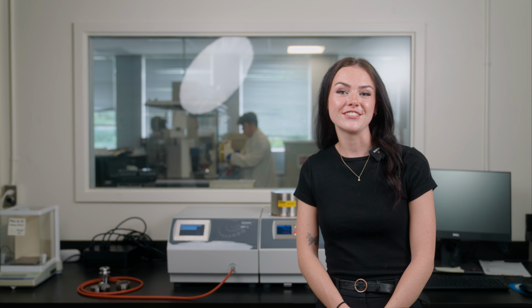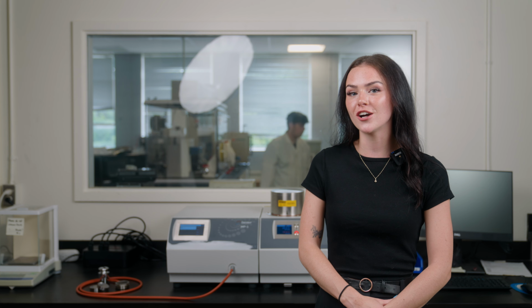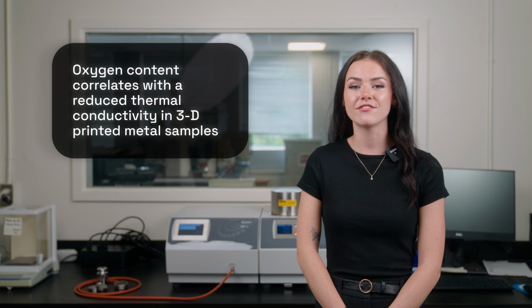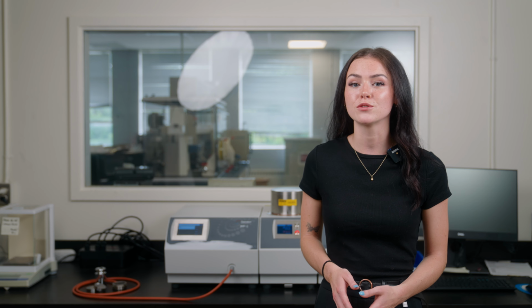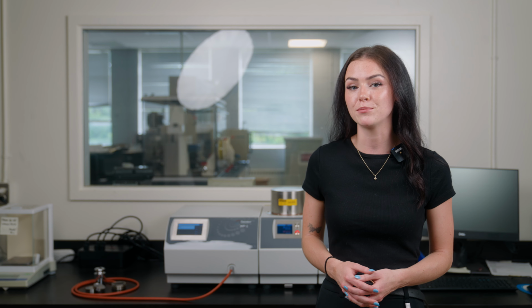We are at the Nanomaterials Lab at the University of New Brunswick for part 2 of our investigation of the impact of nanoscale entrapped oxygen on the thermal conductivity of 3D printed metals. Even though the 3D printed metals have similar density to their solid counterparts, the presence of oxygen or other entrapped gases affects the heat flow within the materials. The nanoscale gas has a lower thermal conductivity than the metal matrix itself. Thus, oxygen content correlates with the reduced overall thermal conductivity, especially noticeable in metal 3D printed samples.